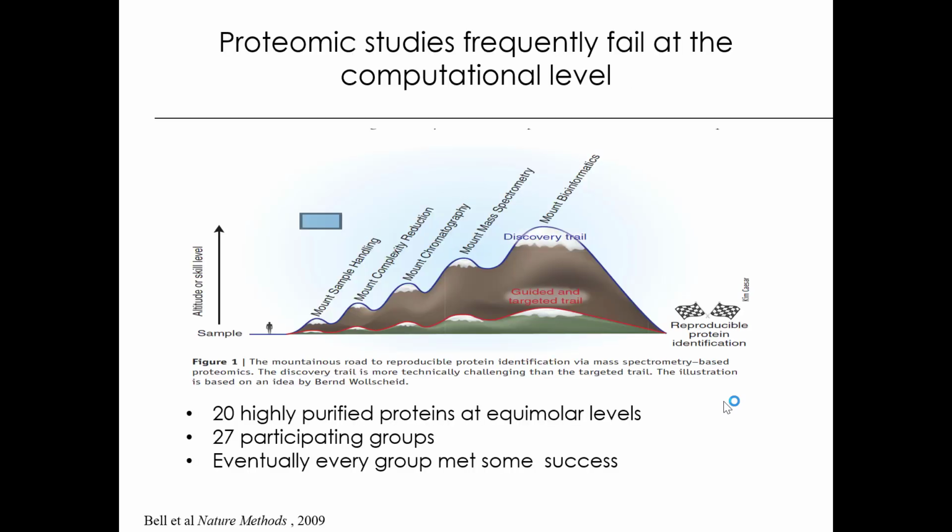the objectives. So you might also ask, why is this course entirely focused on data analysis? When we first applied for funding for such courses, not for this one, but similar courses in Europe, we got rejected by the reviewers, and they said we need to offer a course that covers also wet lab expertise, and we need to do something on the machine. And we always argued that this is not so, that you can separate this, because this is probably the most important part of this whole workflow, the data analysis, because many studies fail at this level.